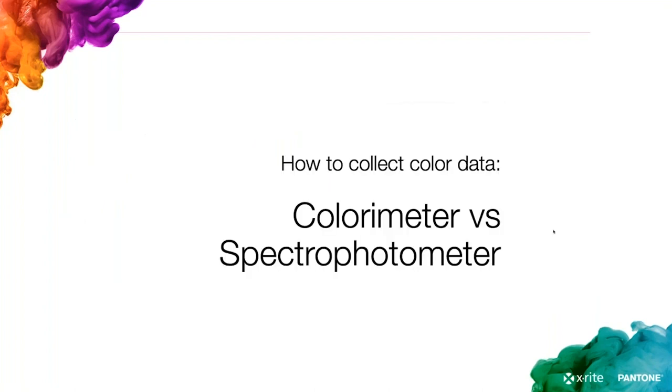So hopefully that made sense. Now we're going to talk about how to collect spectral data, or how to collect color data. I'm going to talk a little bit about a colorimeter versus a spectrophotometer, but I'm mostly going to focus on spectrophotometers.